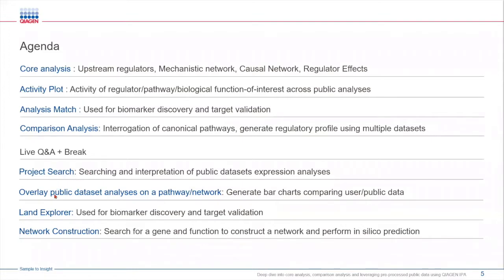Next we will look at the overlay feature for a pathway or a network. This feature will allow users to determine the expression profile of the genes within a public data set or even within your own data set.